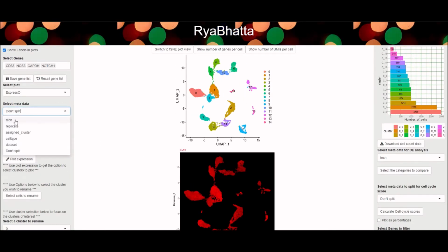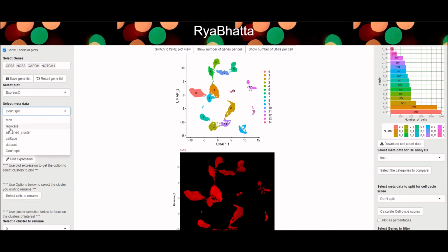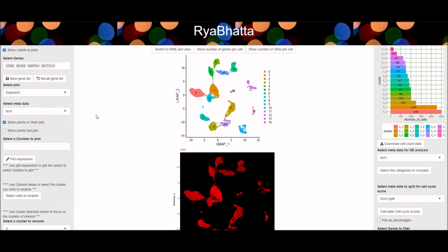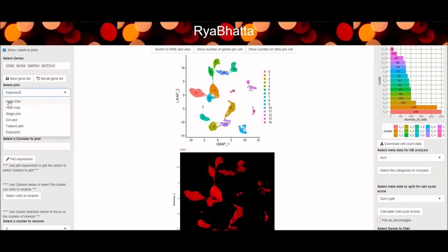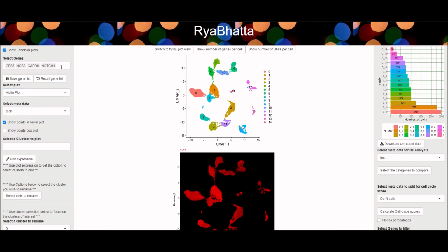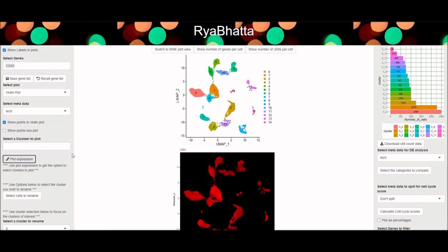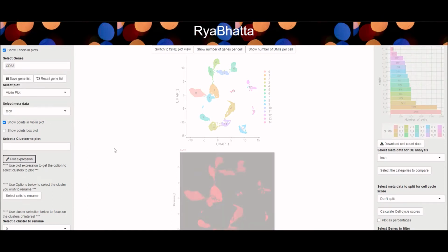The metadata added to the Seurat files can be used to separate the conditions, or samples, or technology used to generate the data. A separate app, that can create such Seurat files from raw sequencing output files, and add metadata, is under development. When you plot the expression of genes with the metadata selected, the plot is split into individual categories showing expression per condition in each cluster.